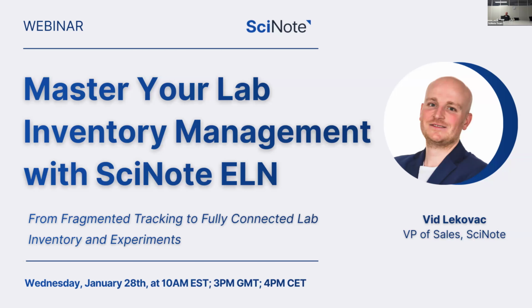Great. Okay, so what we're going to start with today: the title of the webinar is Master Your Lab Inventory Management with SciNote ELN. I want to do a quick introduction into what we want to do with today's webinar and what we are planning to do in the next few weeks. So this is actually the first webinar in at least a 3-part series. Today we're going to go through the overview of lab inventory management, some of the challenges, and we're also going to finish up with a use case.